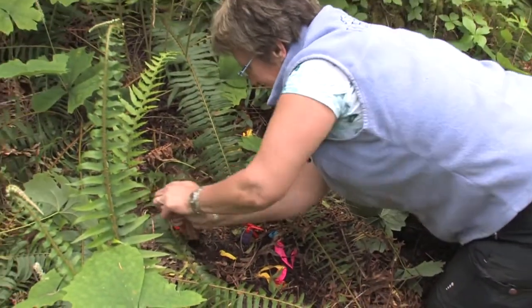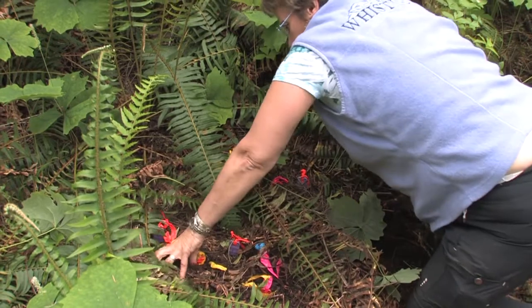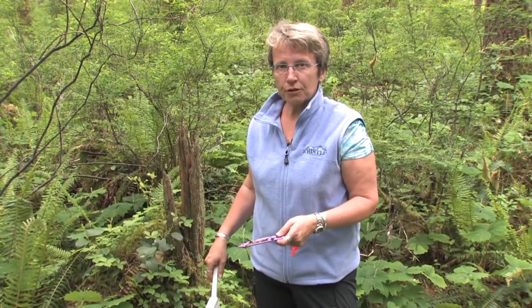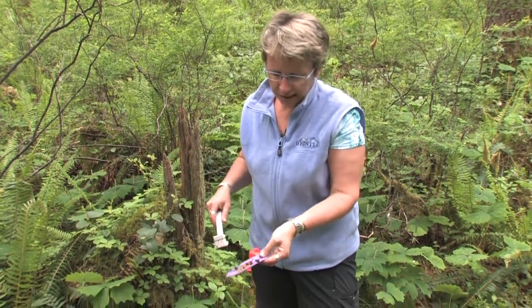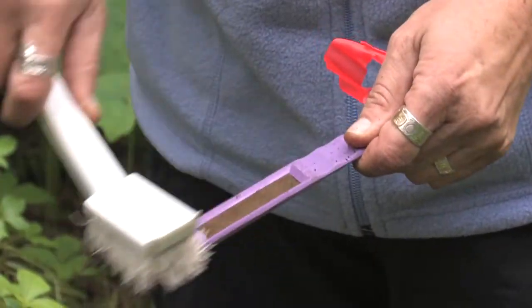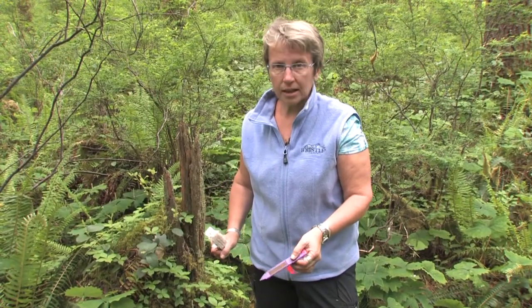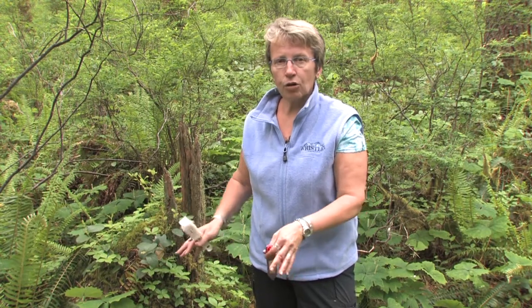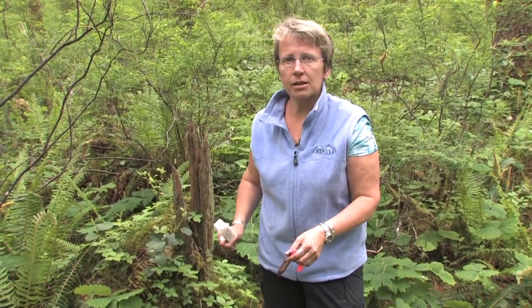For the mineral soil samples you need the flagging tape because the probes go so much deeper. Two months after insertion, we come back, remove the probes, and brush off any organic soil material. We wash each probe with deionized water, then bag all the probes from one area together. The probes are then sent to Western Ag Innovations in Saskatoon where they're analyzed for anions and cations.